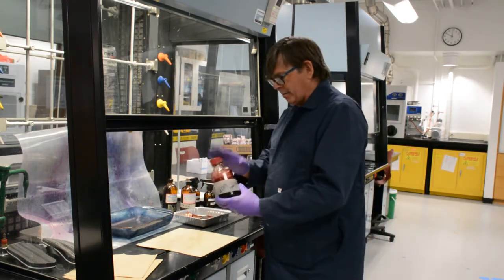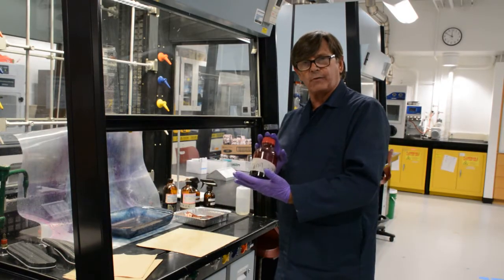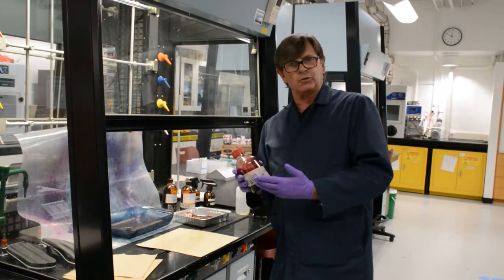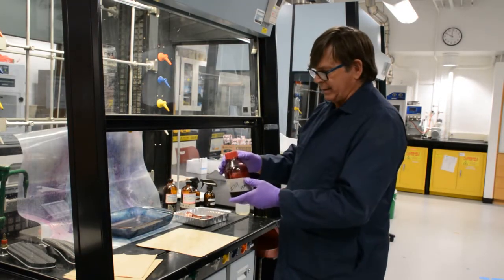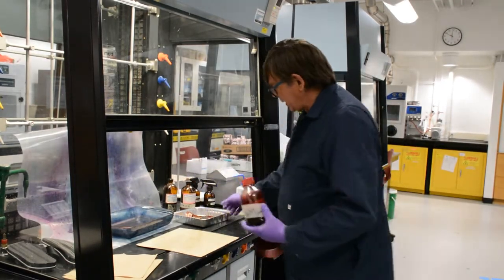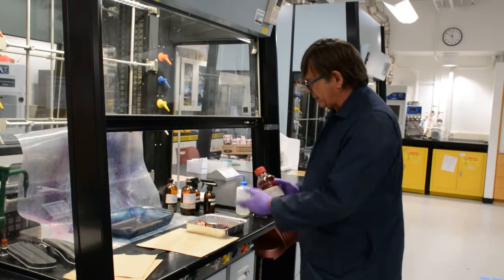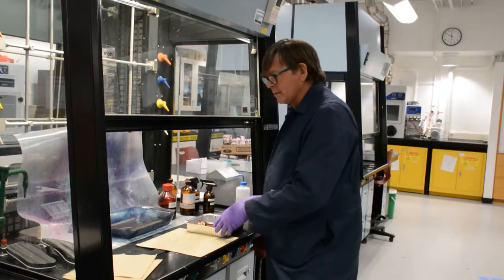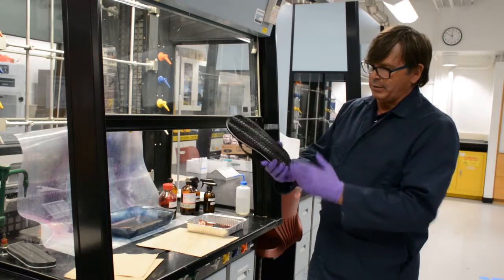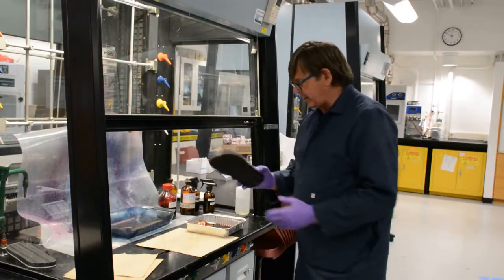So the blood, again, as we described in the other video, is sheep's blood that comes from the federal government. It's pathogen-free. No animal was injured during the collection of it, and it's safe to use. Now, what we've done is we've taken some of the blood from the bottle and poured it into the tray here for convenience, because the shoes that we are going to use, these beach sandals, won't fit into the tray to actually accumulate blood on the outsole.